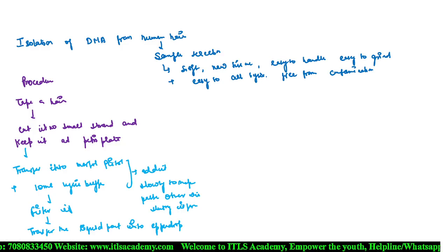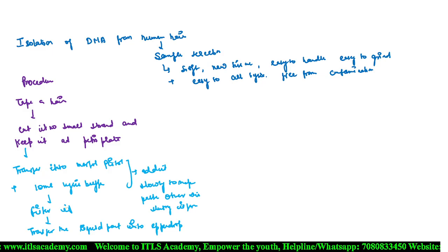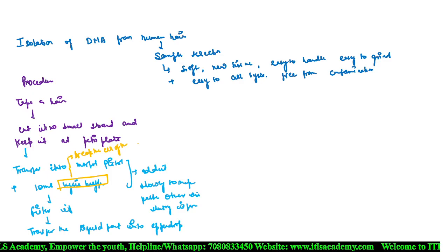Lysis buffer is used to break the cell of the human hair. Lysis buffer is what? It is used to break the cell of the human hair.